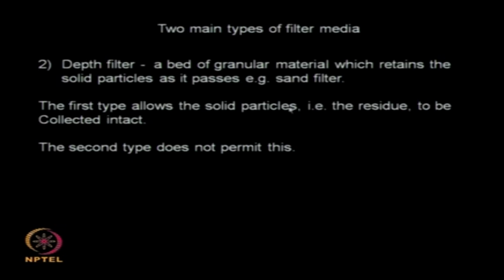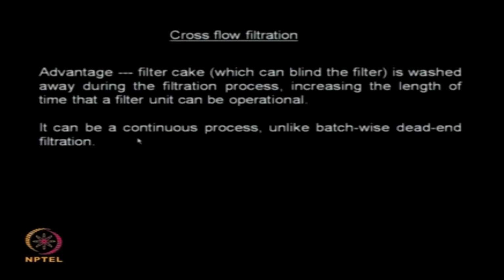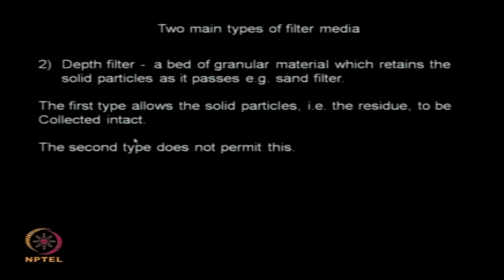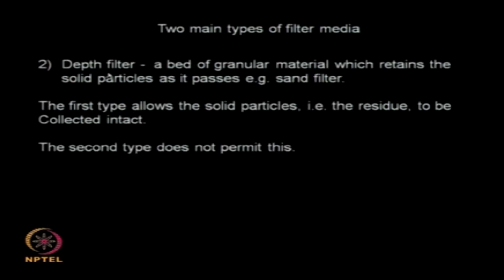The surface filter allows the solid particles, that is the residue, to be collected intact, whereas the depth filter does not allow you to collect the solids intact. So here we are more interested in the liquids, and the amount of solids that is present is not also very large. So in that situation depth filter is ideal.